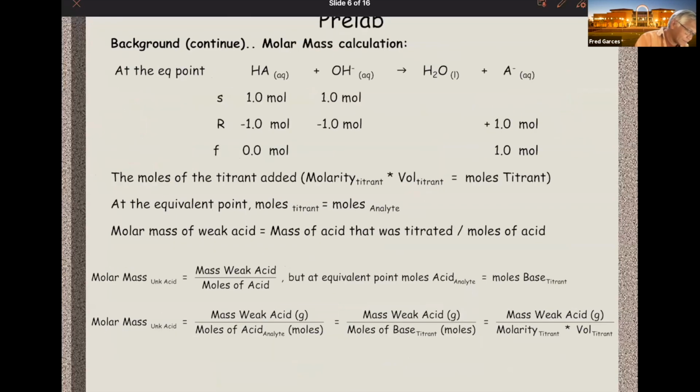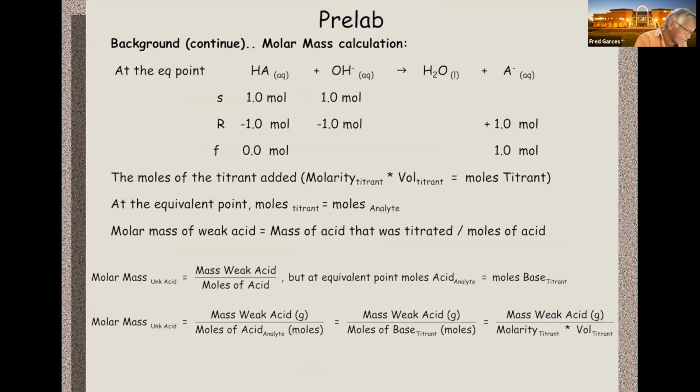Anyway, what will happen is that you guys are going to do the titration. In this particular case, you are going to titrate it to the equivalence point, or at least you will know the equivalent volume. And at the equivalent volume, you can say that the moles of the base equals the moles of the acid, which is what I talked to you guys about, okay?